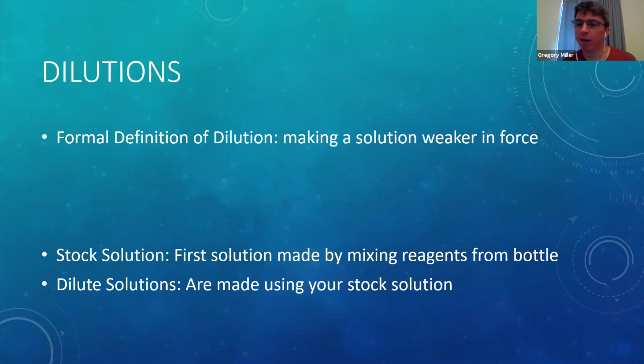So what's a dilution? The formal definition is making a solution weaker in force. All it really is, you're making the concentration go down. You're adding more of your solvent, you're diluting it, there's less of your solute in it.